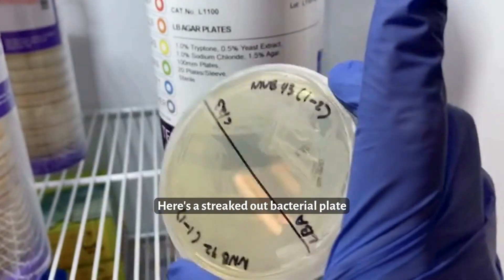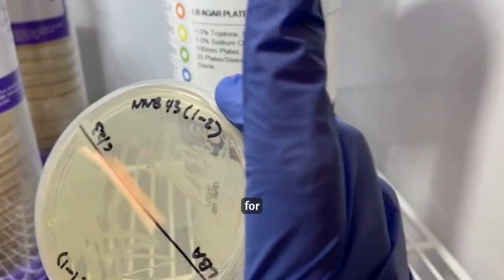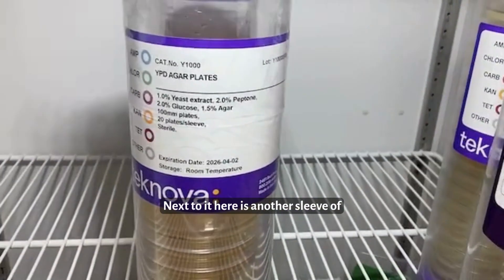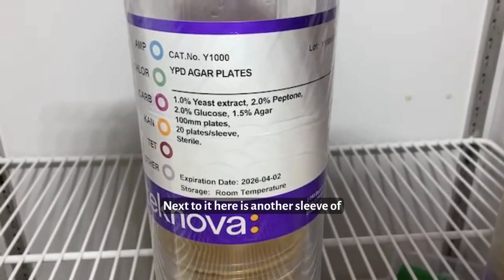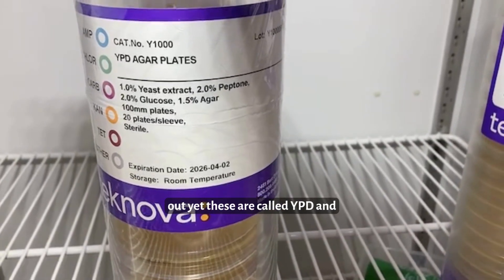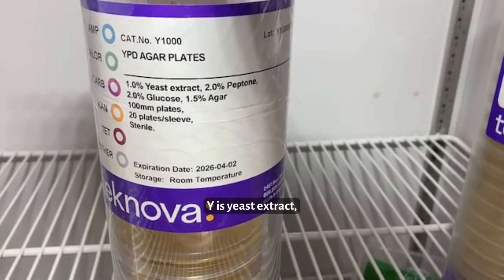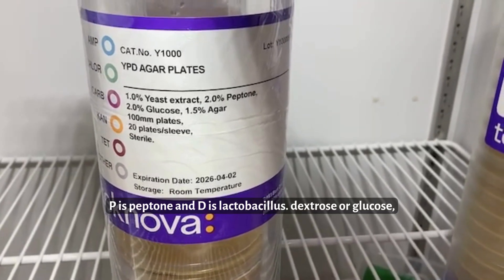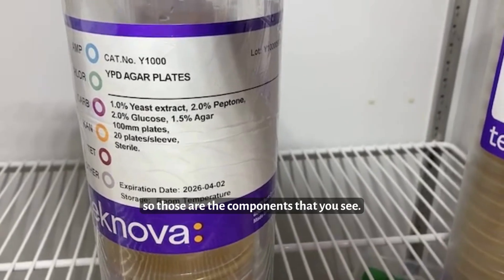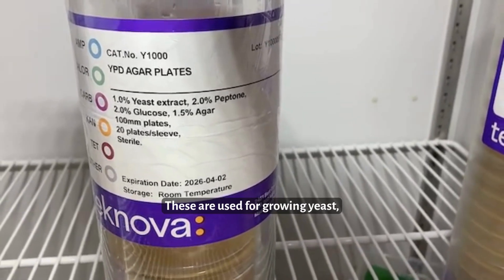Here's a streaked out bacterial plate for some of the BioBuilder labs. Next to it, here's another sleeve of petri dishes that have not been streaked out yet. These are called YPD — Y is yeast extract, P is peptone, and D is dextrose or glucose. Those are used for growing yeast.